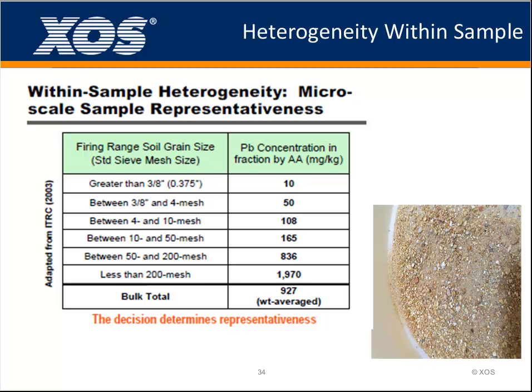This is a common conclusion that in very small particle size, the concentration of heavy metals are generally much higher than the large particles. So if we are analyzing soil samples directly for heavy metals result, we are analyzing the average result of all size particles.